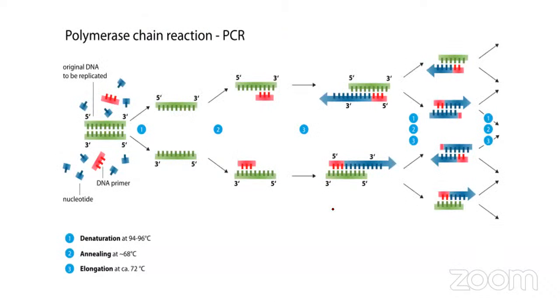This is what I use in explaining PCR in its simplest form. And I pray that you flow along with me. So PCR is a molecular technique that is used in the lab to amplify the gene of interest. When you amplify that, you have multiple copies of a gene of interest, then it can do downstream activities too. So that's the essence of PCR. Polymerase chain reaction amplifies one single gene to 2, 2 to 4, 4 to 8, 8 to 16, 16 to 32, and things like that.